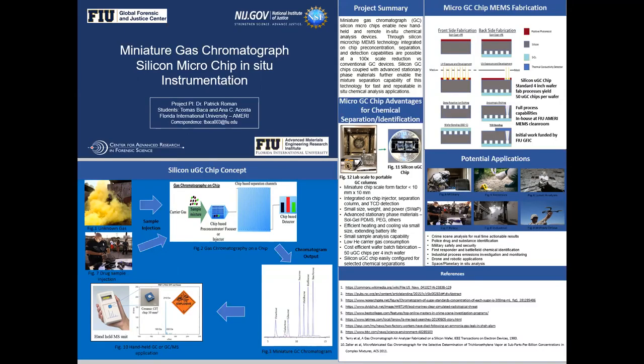a cutoff, like a path that just cuts off at the end of the chip, and then connect stuff to that. That's much harder than just ending the path on the front side, and from the bottom side digging to, or etching to the column, so that we can make the injector and such in that area.